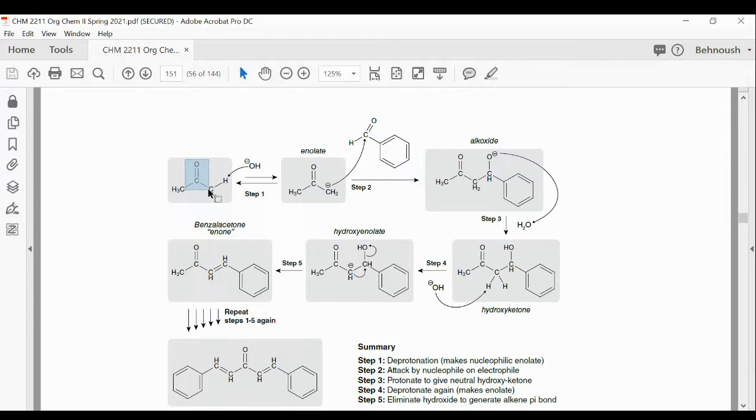Just pay attention to these numbers, because that's how you can identify your final product and confirm that the final product has formed. The C=O double bond from acetone shows a peak between 1700 and 1715. Okay.